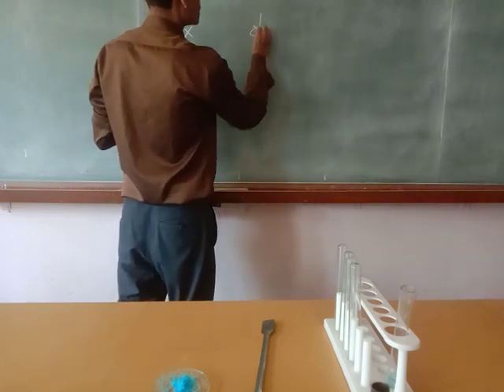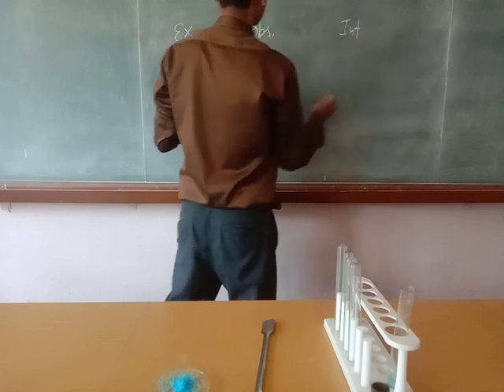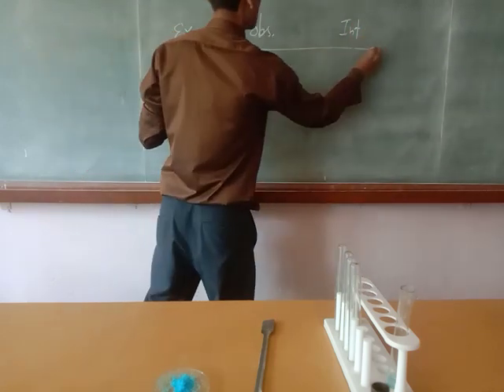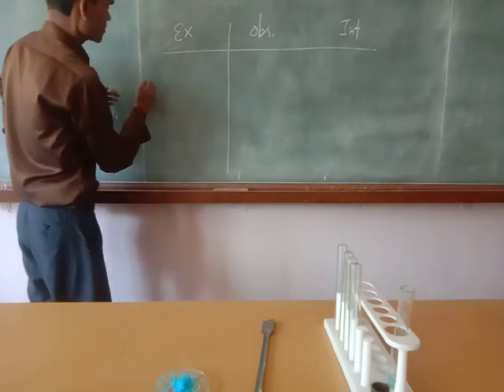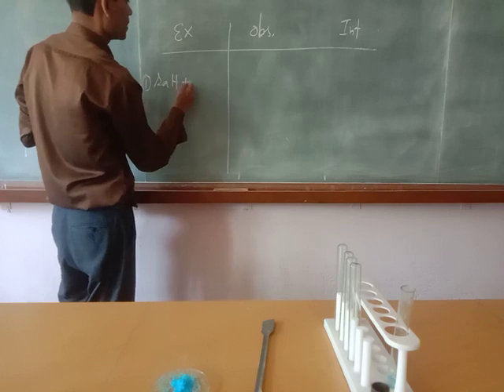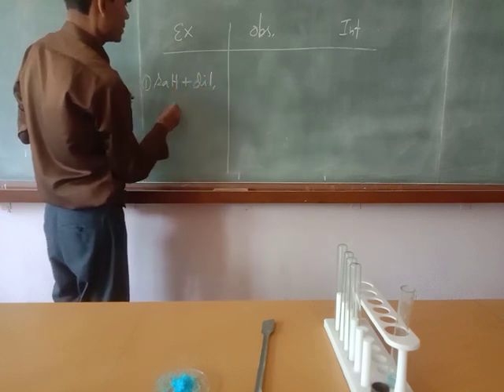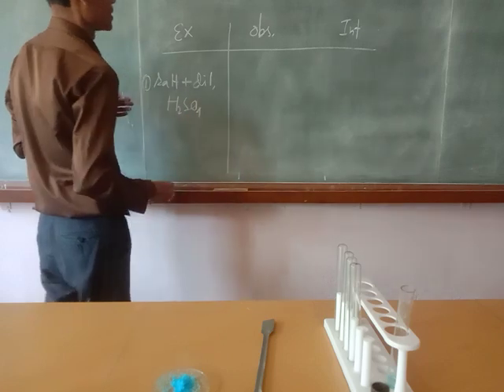This is observation and this is inference. Salt plus dilute H2SO4.